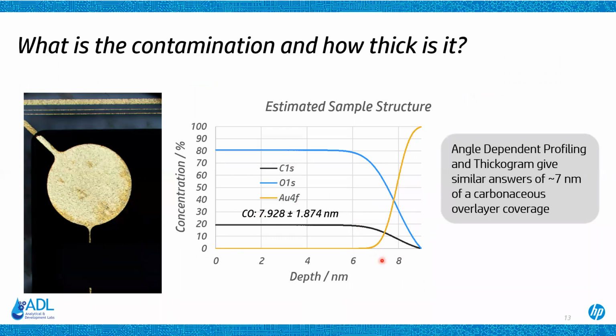And so that's a nice way to corroborate what we think it is, what you estimate it is from looking at the spectra initially, and then doing the two calculations, you come up with an answer that seems about right. Is it good to 5 decimal places? No, but it's amazing what computers do.